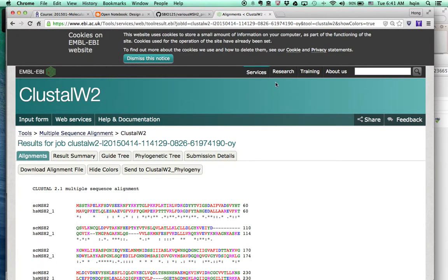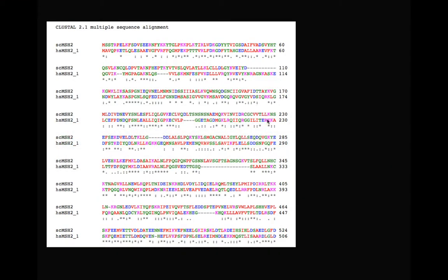So what this alignment is, you can see in the first 1 to 60, the sequences are perfectly aligned. They are also a 1-to-1 correspondence. So for the 60th position in yeast, you also see the same position in human, 60-60.